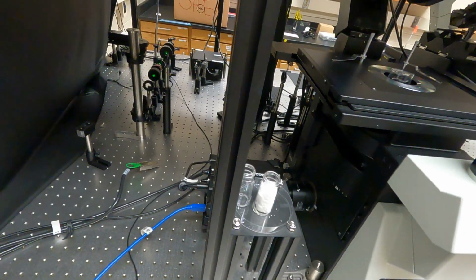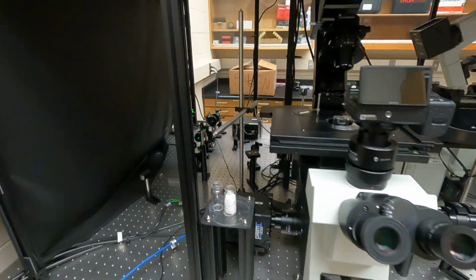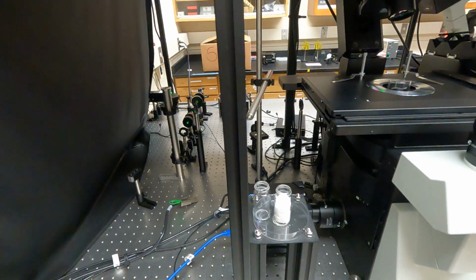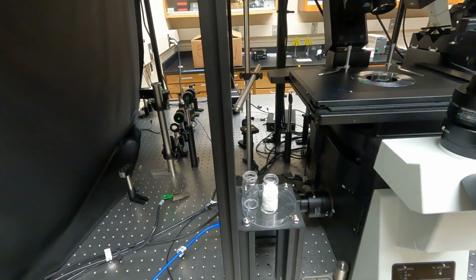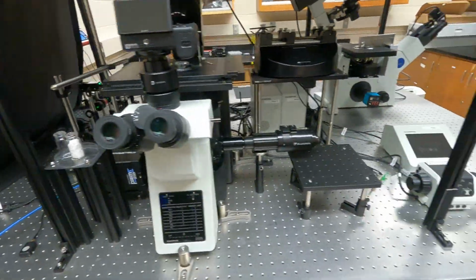So that's pretty much all regarding the laser unit. Again, the only things a student ever needs to touch would be the continuous neutral density filter and also the flipping mirror. Nothing else.